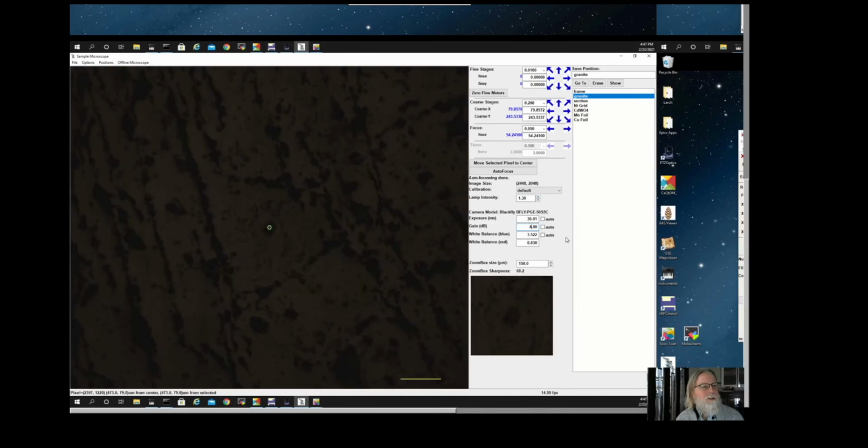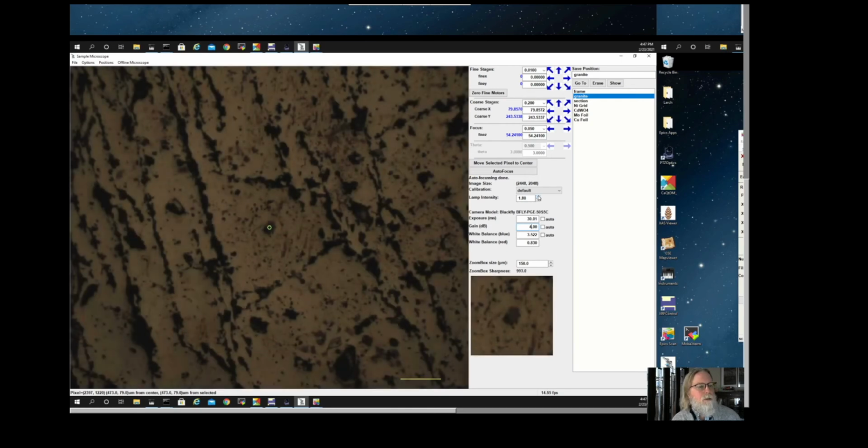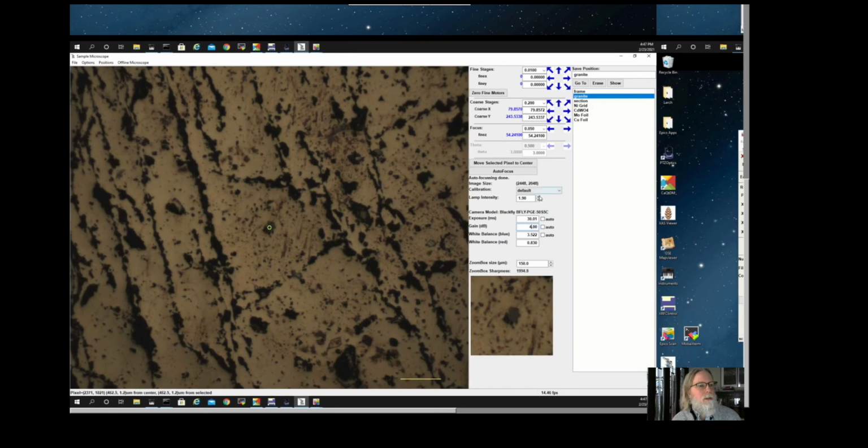You can also see that as I'm doing this over RealVNC to my home computer, there's a little bit of a lag, and sometimes the image gets jumpy as it's a pretty high resolution image, 2000 by 2000 pixels in color, that is being sent over RealVNC.